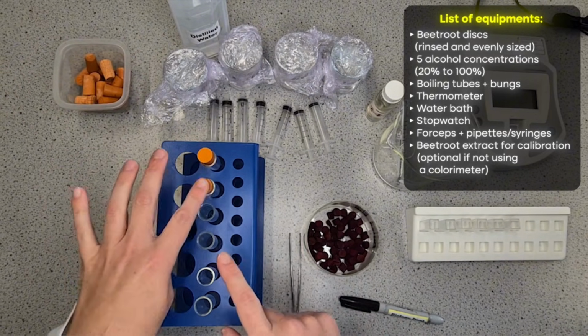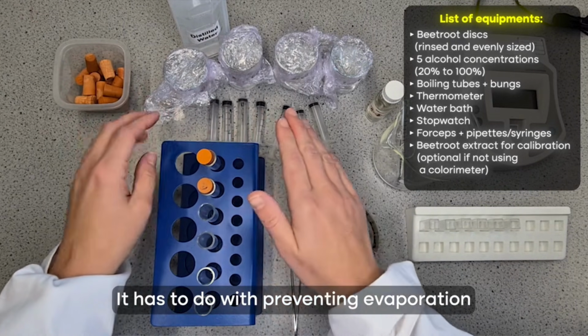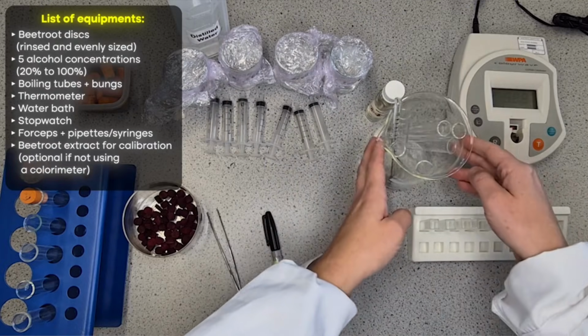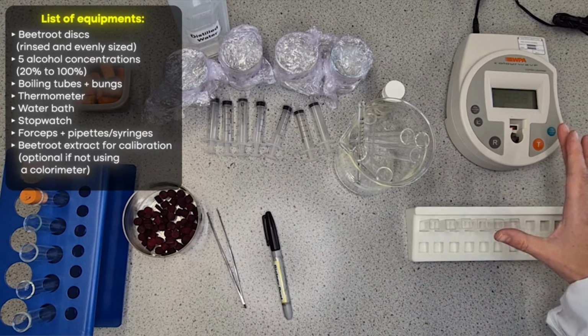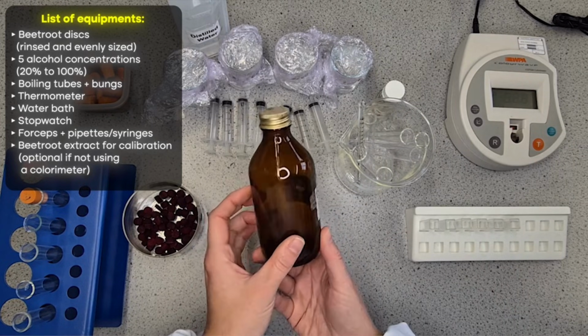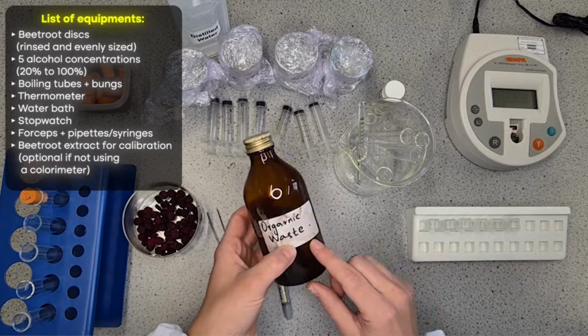I'll come back to that in a bit more detail, why we do that later, but it's to do with preventing evaporation. That's a really common exam question, but I'll come to that when I set it up. Lastly, we can see over here, I've got my colorimeter and my cuvette, which I'm going to be using to turn my qualitative results into quantitative results. And on top of that, I do have an organic waste bottle to pour all the ethanol in at the end, because ethanol is harmful to the environment, so it cannot be poured down the sink.